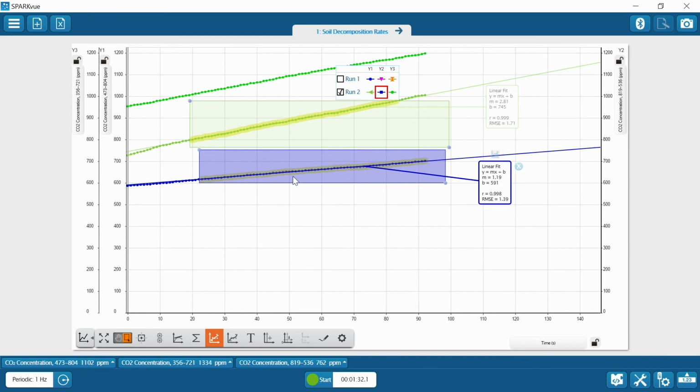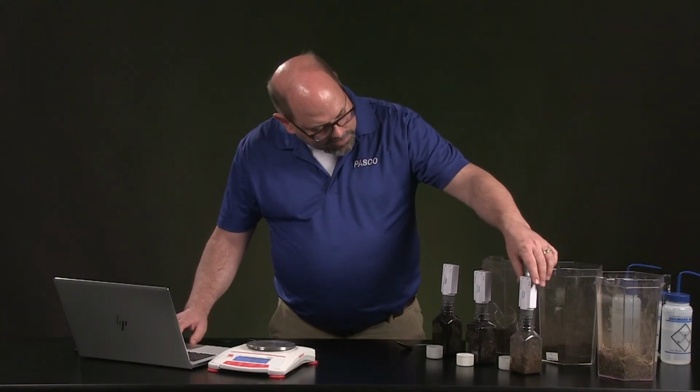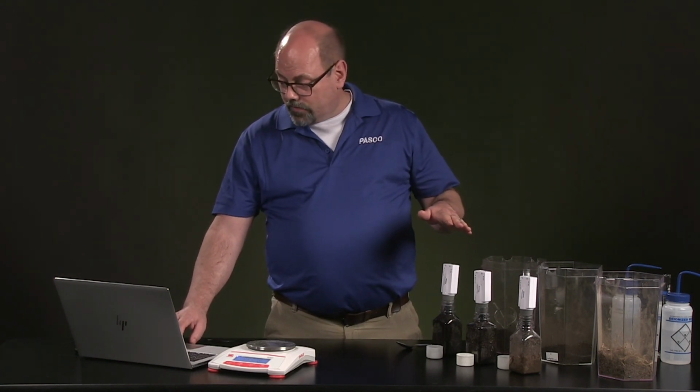The last one, I'm going to switch to the more Kelly green, and I'll make a box here, and we will get our best line through that, and I will move that so it's up here and we don't confuse which value stands for which one. So I'm going to click on the first one again, Y1 in our case, and I can double check by looking at the number on the sensor, especially when you're using the same sensor for all 3 of these. It can be a little confusing.